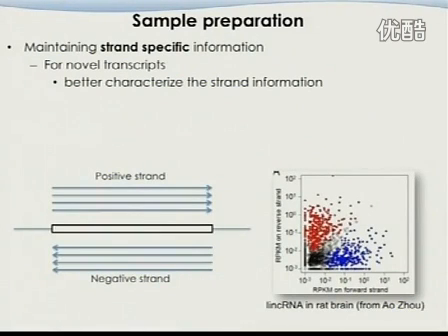This is one of the figures generated by Al. So he is studying non-coding RNA. We know that for these non-coding RNAs, the annotation is really, really poor, right? We are not even convinced whether there should be an RNA molecule there. But the hope is if there is a real signal, you will observe intensively biased sequencing reads from one strand versus the other strand, because it's not that likely that one is this strand, the other one is this strand on the same location. It's not very likely. If you use the protocol that doesn't retain the strand information, you are not able to find that.